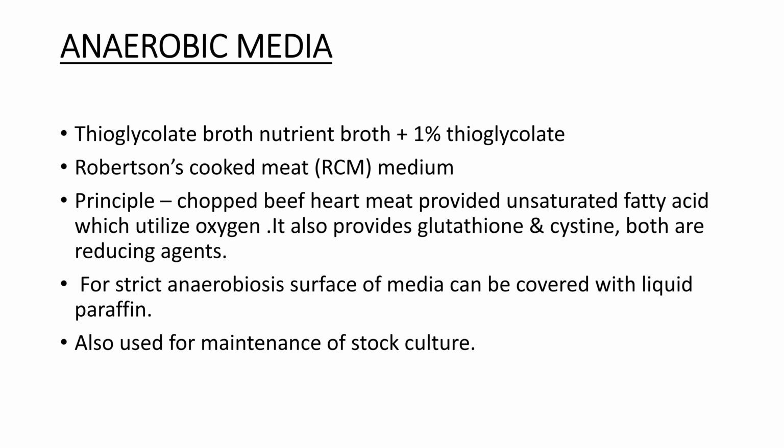But now we are going to discuss the anaerobic media. In anaerobic media, there is thioglycolate broth, nutrient broth with 1% thioglycolate. The thioglycolate acts as a reducing agent, right? So it helps utilize the oxygen and thus creates an environment of anaerobiosis so that the anaerobic bacteria can grow in it.